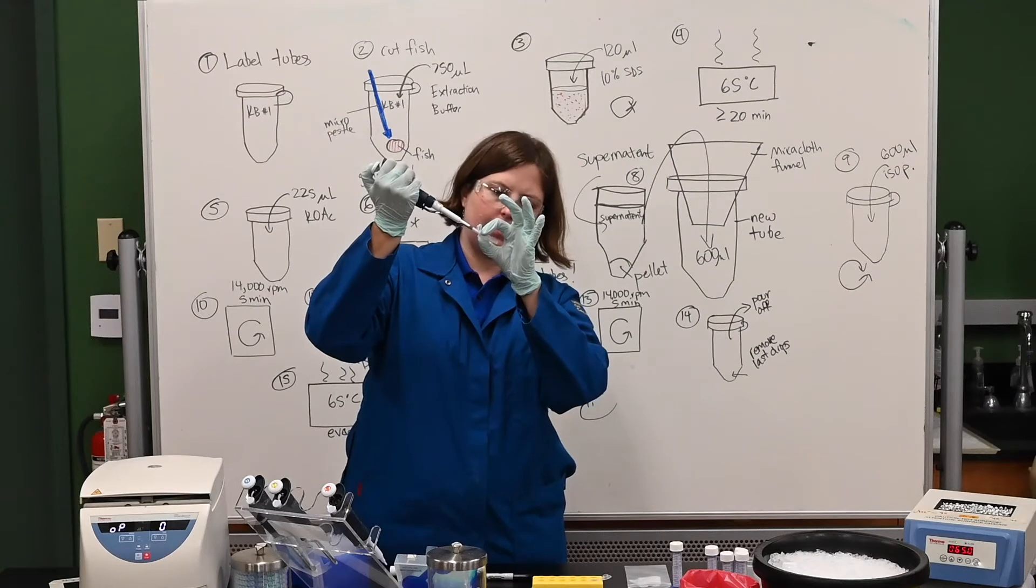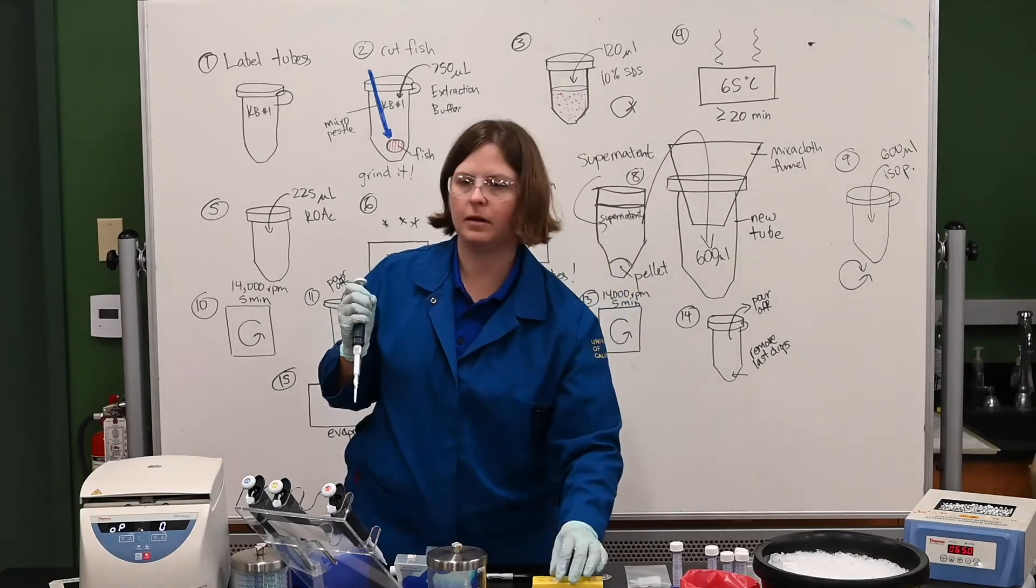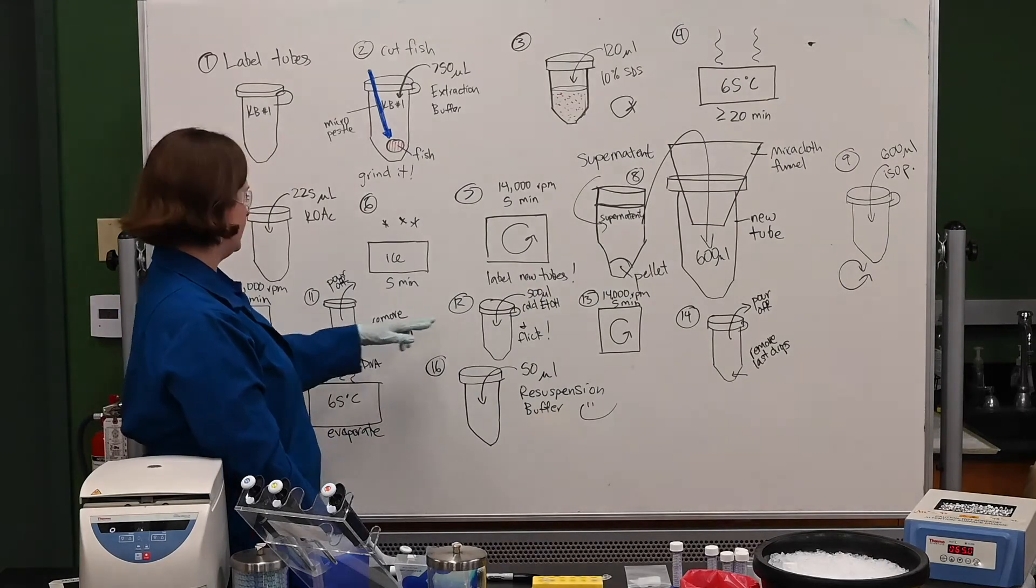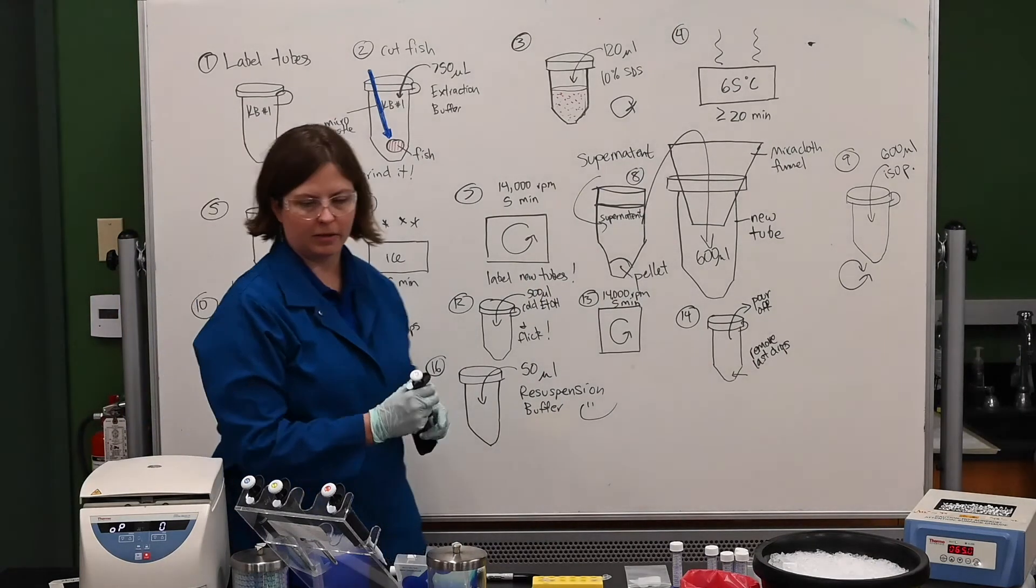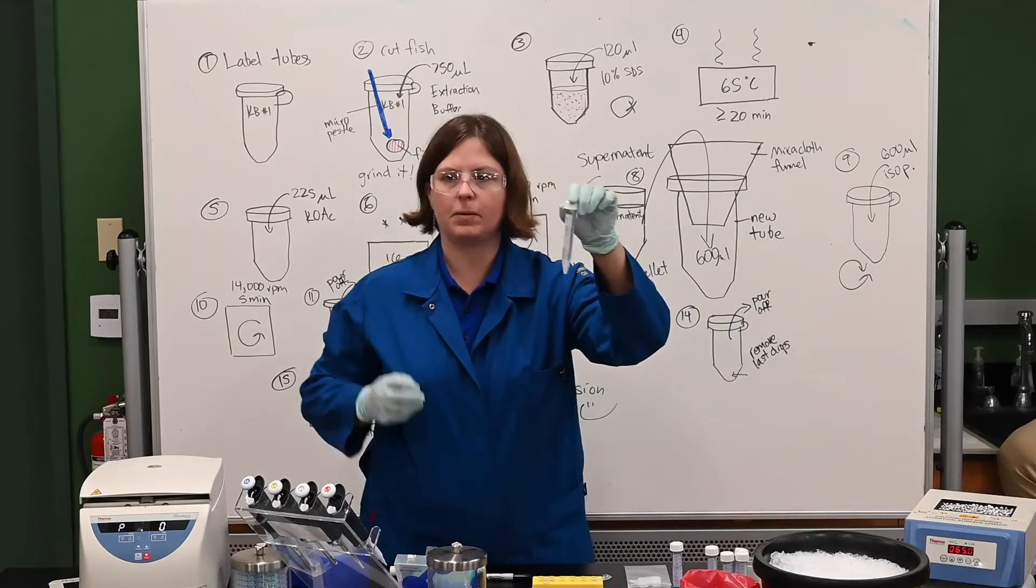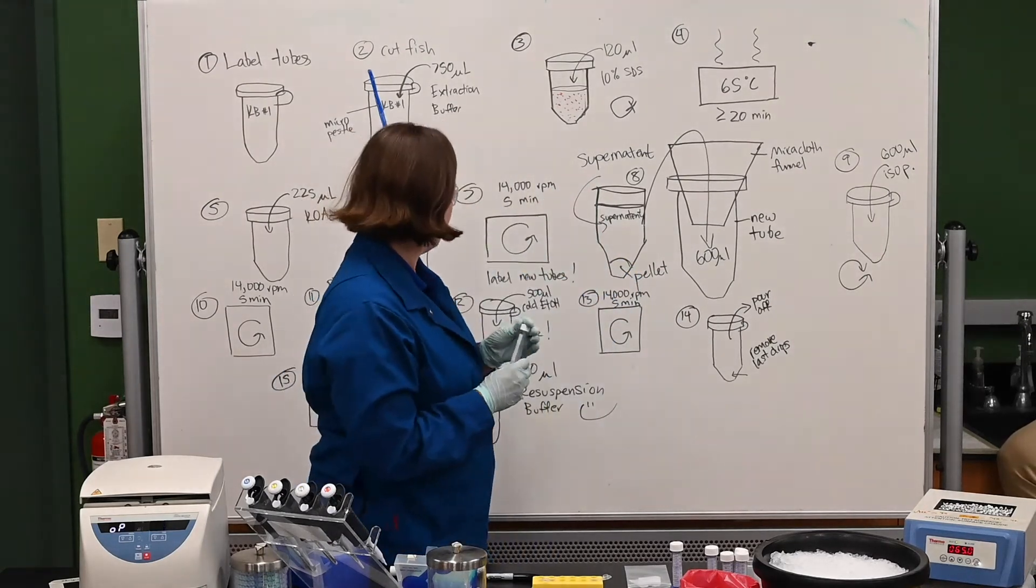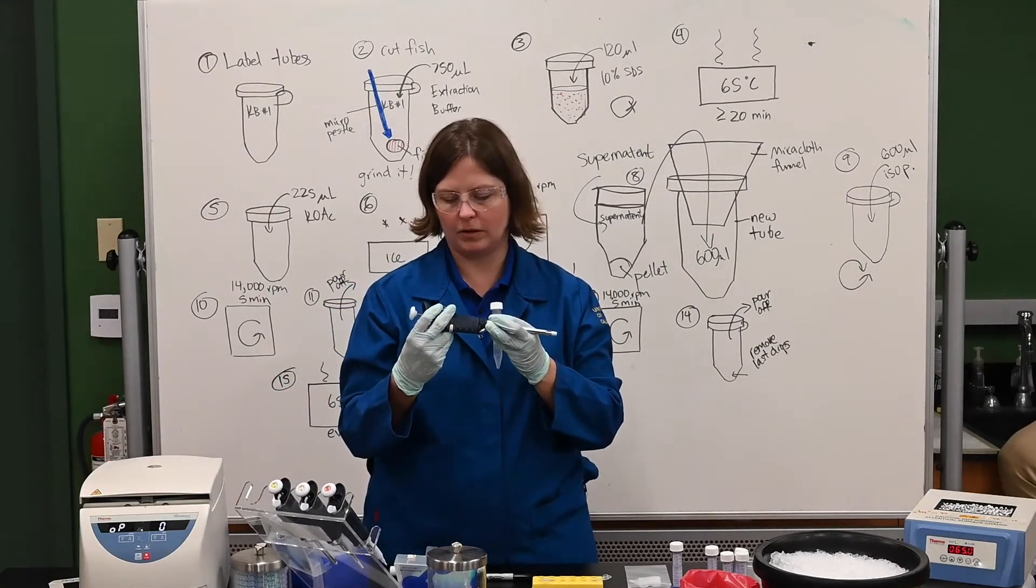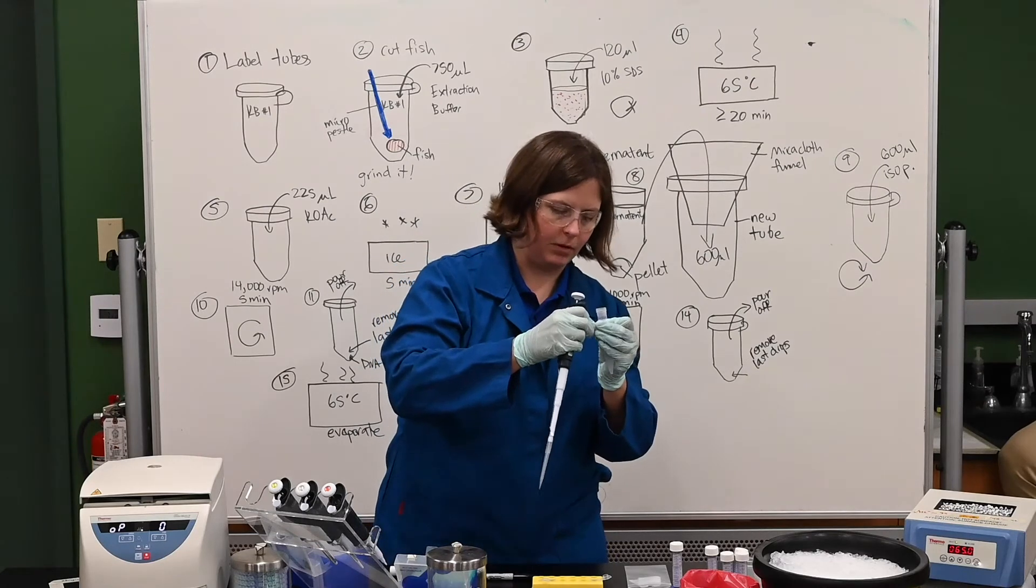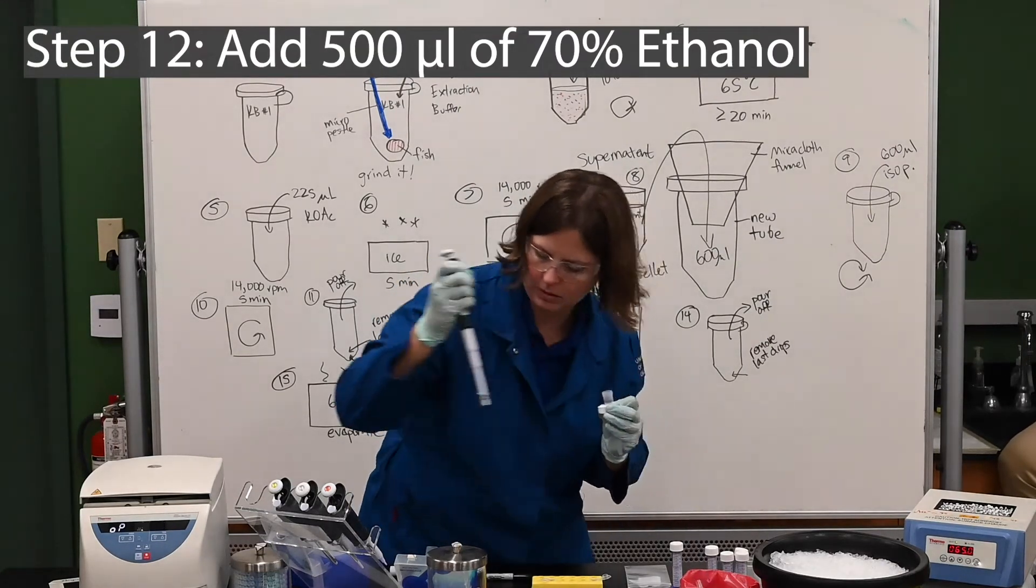So right now, our DNA should be at the bottom of our tube, stuck to the side of the wall. And we want to wash it again, just to make sure we've gotten rid of all the SDS, the salts, everything that was in there. So what we're going to do, step 12, we're going to add some ethanol. So ethanol is that two carbon alcohol that you could drink. We're not going to, this is 70% alcohol, which means it's 140 proof. You can't buy this to drink it in the U.S. But what it does is it's going to help wash away those salts from our DNA. It's going to make it nice and clean. So we have the pure clean DNA sample to work with. So I'm supposed to add 500 microliters cold ethanol.